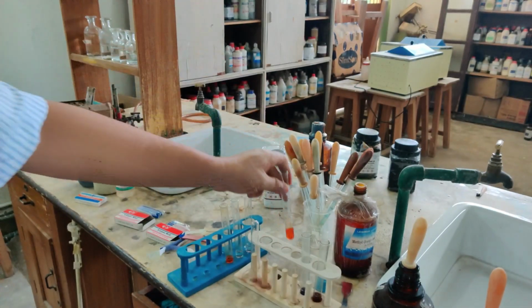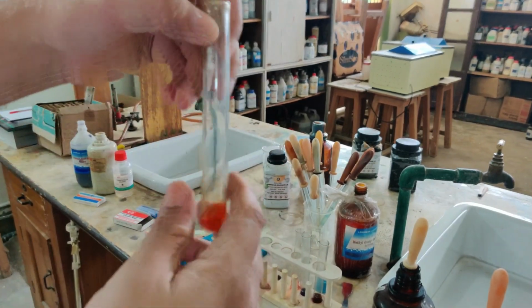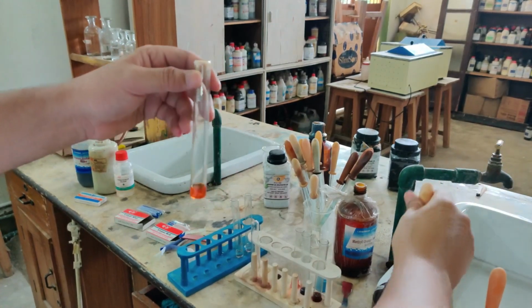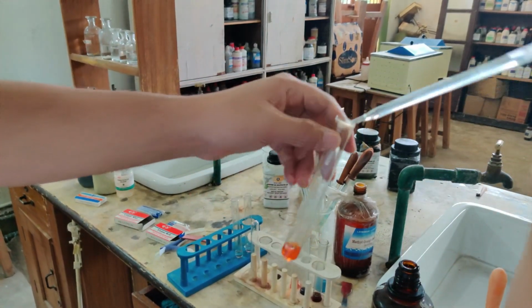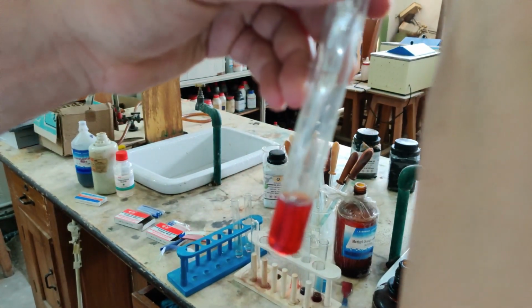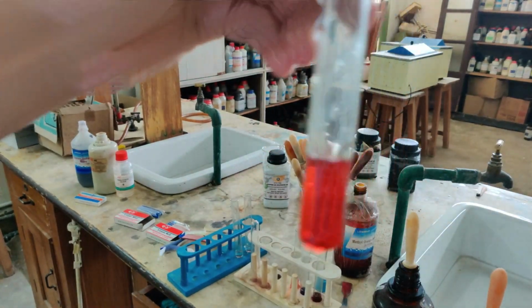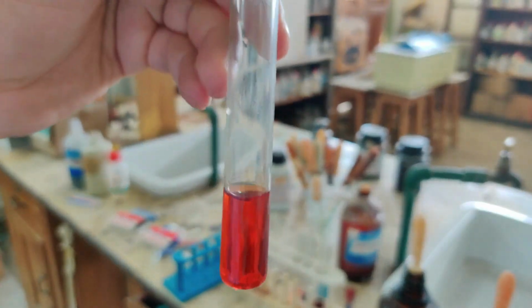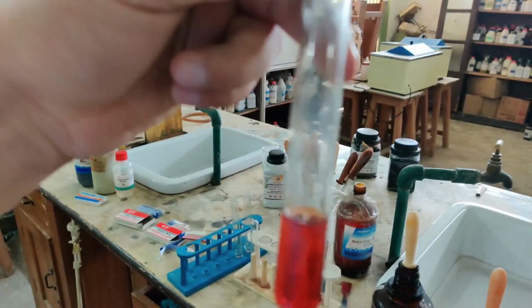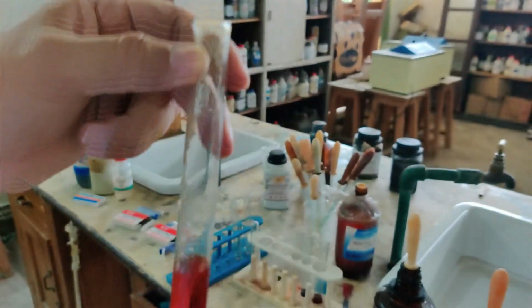Now let me test this methyl orange with base. Let's see what happens with base. With base it must turn yellow. So if I am adding now ammonium hydroxide, it is very difficult to distinguish yellow, pink and this one, but you can see the color change that is taking place. Now it has somewhat become yellowish in color, even though not much change is what you should notice. As I said, to distinguish pink, yellow and orange becomes a little difficult, but nevertheless there have been some color changes.